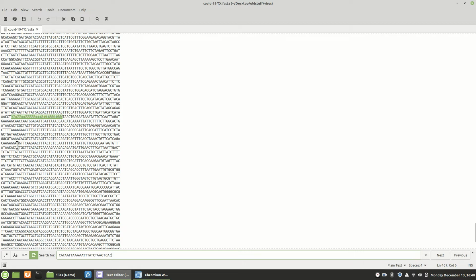And so I reduced the size of the sequence, and I'm going to suggest for you guys, maybe you can alter this so that you get some results, is to use a much smaller piece of sequence. Keep it at 10. Just find 10 smaller pieces of sequence. They don't have to be contiguous. Do a few at the beginning, a few at the end, a few in the middle, and you don't have to do the whole sequence. And hopefully this will allow you to get some hits.